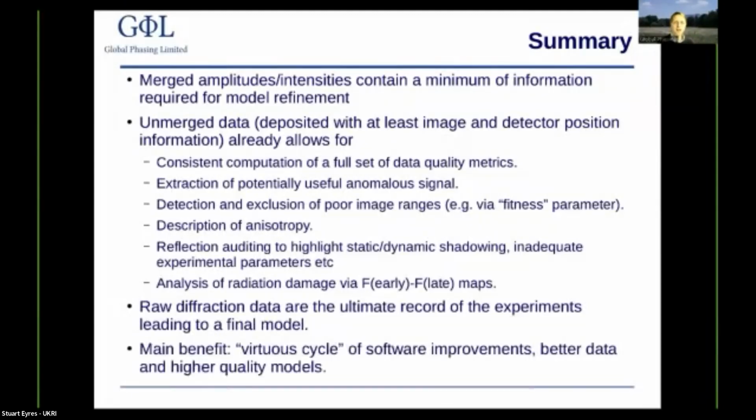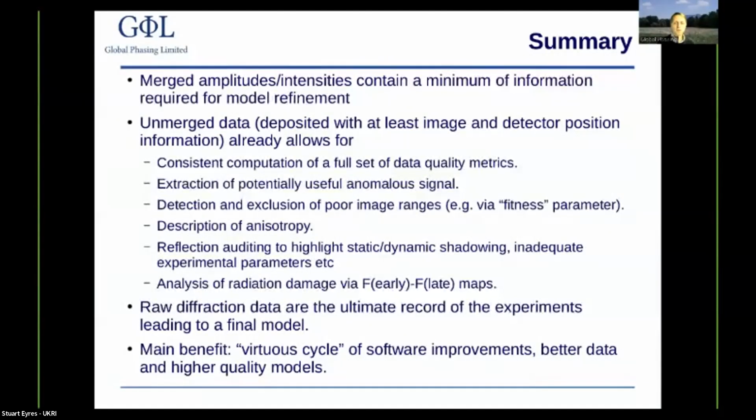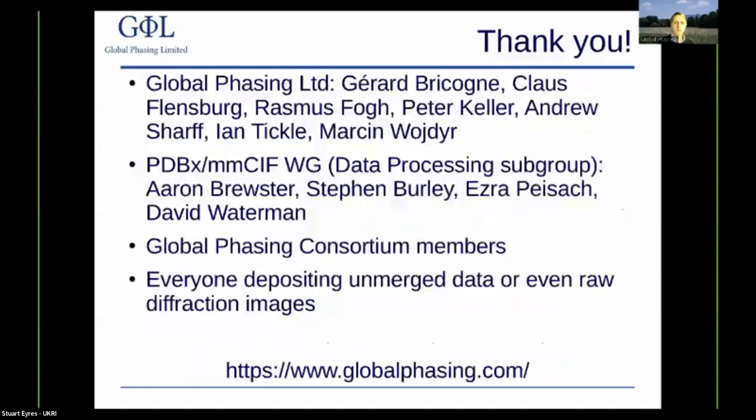metadata. Ultimately, we hope for a similar virtuous cycle as seen when merged reflection data was made compulsory for deposition to the PDB. So we hope many more users take the opportunity and deposit more than just the final set of reflection data coming out of a refinement program. A multi-data block reflection mmCIF file with various sets of merged as well as unmerged data should not be a scary proposition and would provide real added value to both users and software developers.